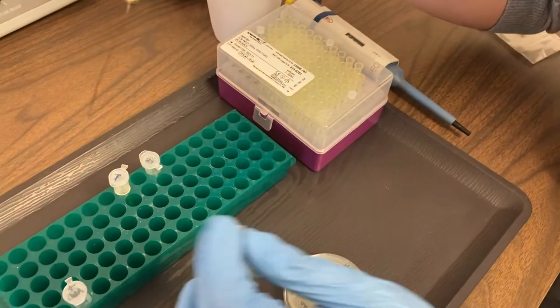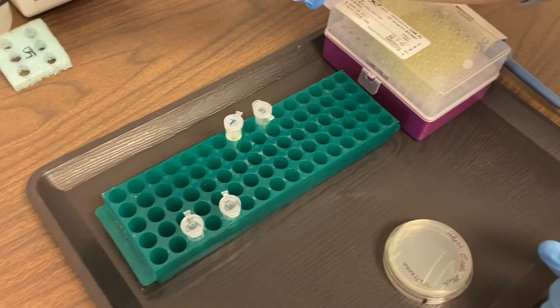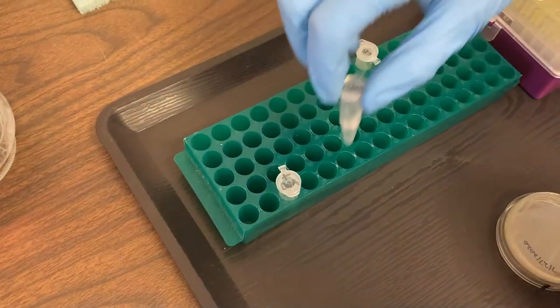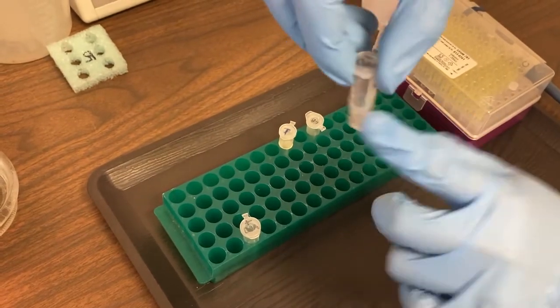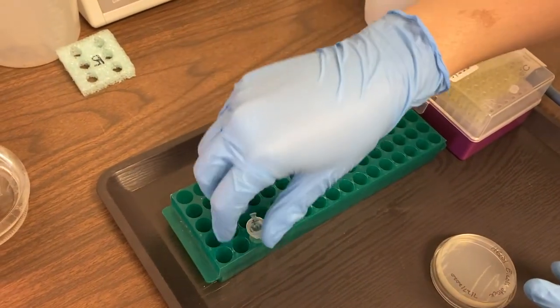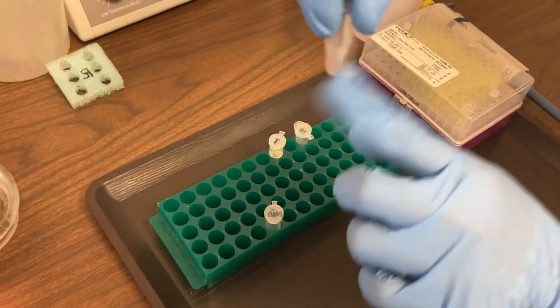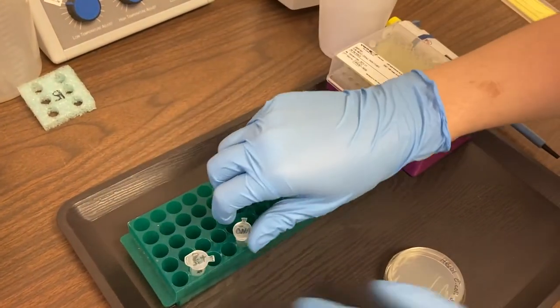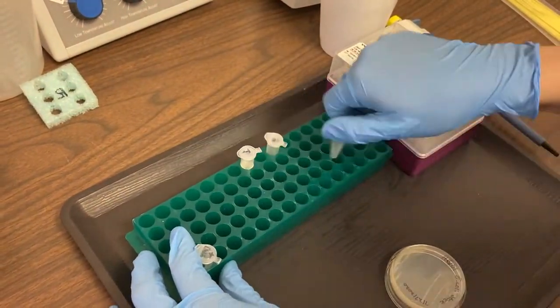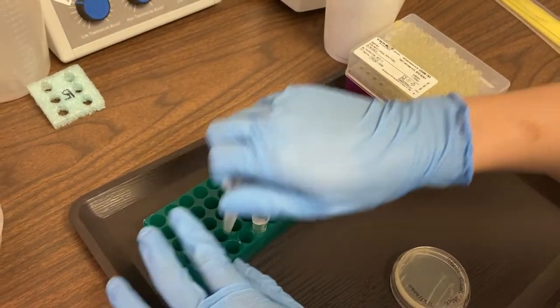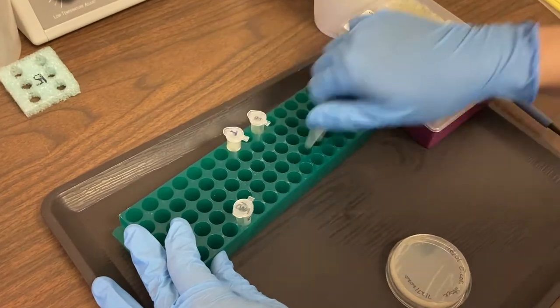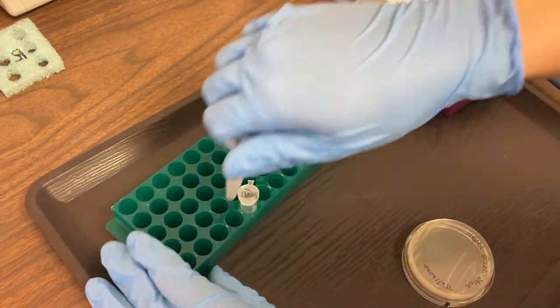Now that our bacteria is in there we're going to make sure that it is mixed well with the calcium chloride. One way we can do that is by flicking the tube. Make sure you have a good grip on the top before you do this. The second way you can do this is called racking your microtube. You use your microtube rack and you run the tube across the top of it. It does a really good job of mixing up the bacteria into that calcium chloride.